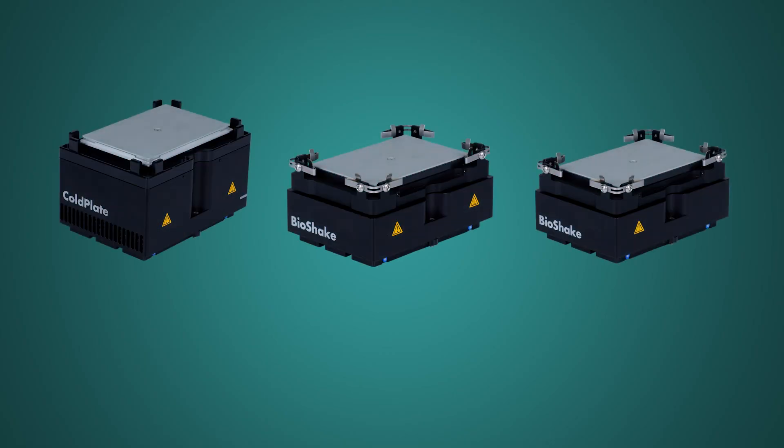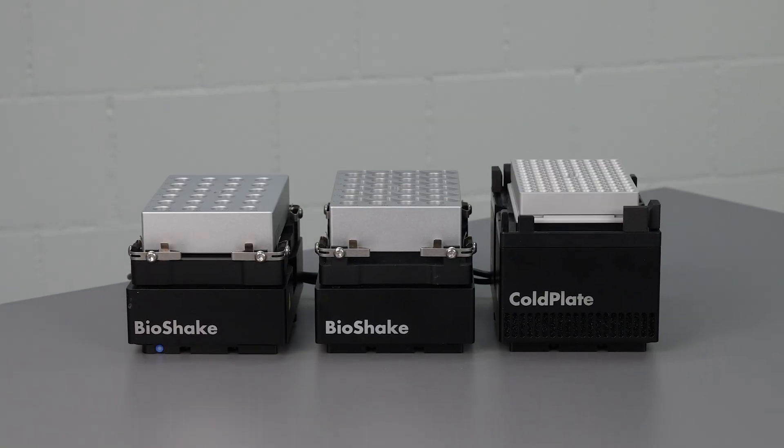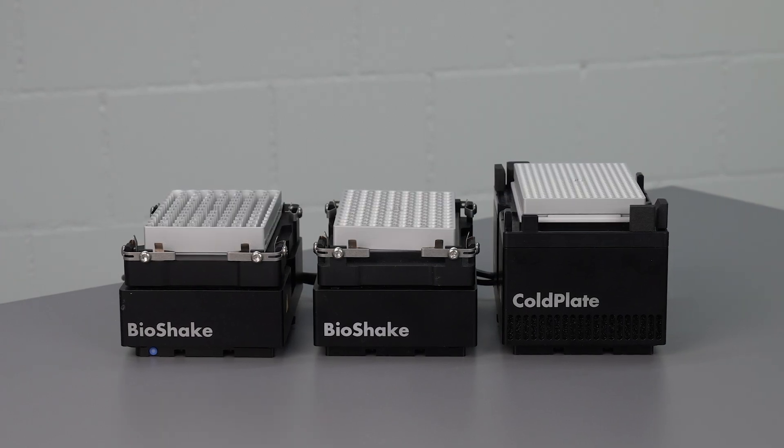The Cold Plate and BioShake modules offer precise temperature control for different labware types, in addition to efficient orbital shaking, ensuring assay reproducibility and accurate results.